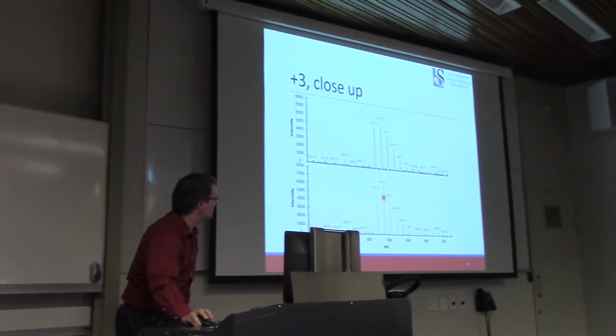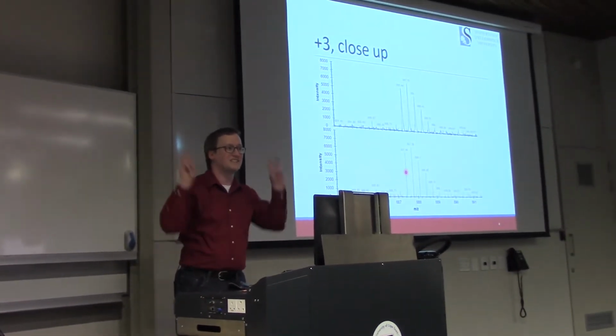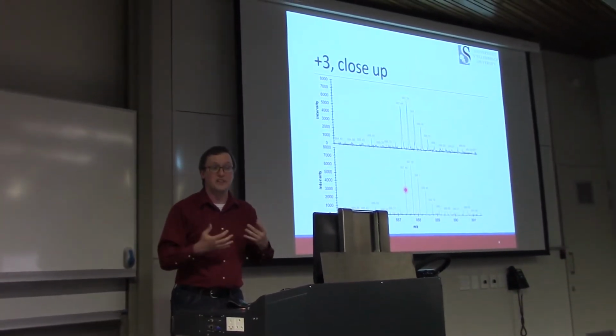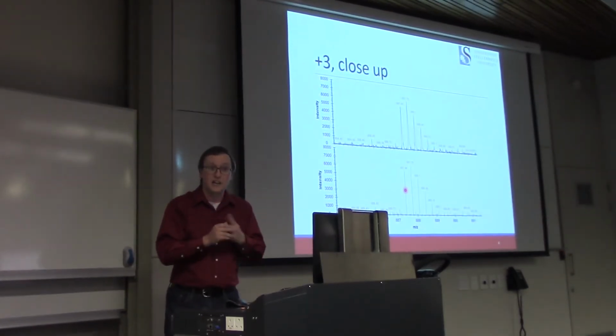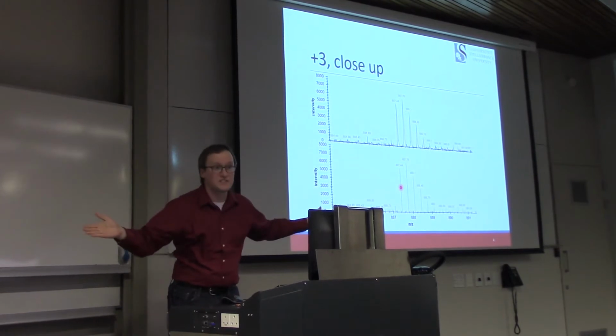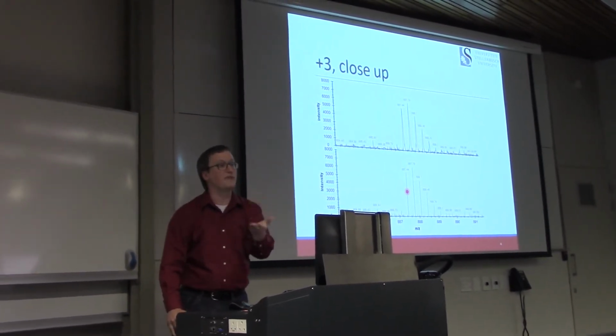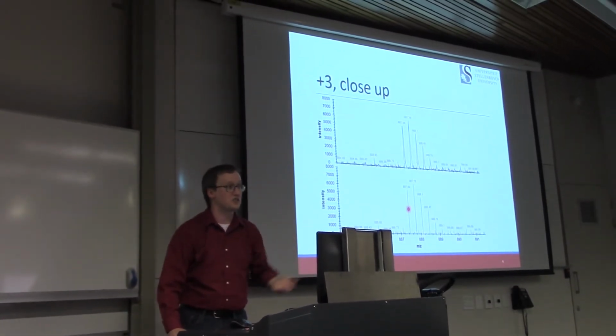So we need to be able to produce this. Now these sticks down at the bottom were produced by a centroid algorithm that's built into the Analyst software. And I know that because ProteoWizard, by default, the way everyone seems to use it, will call the peak picker that was provided by the people who sold us the instrument.